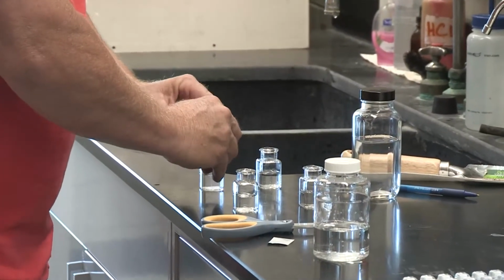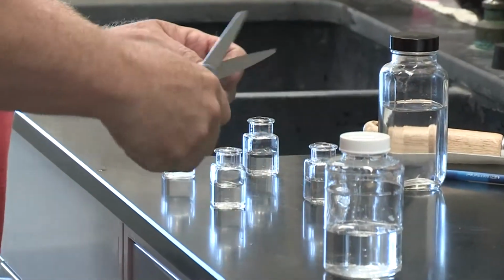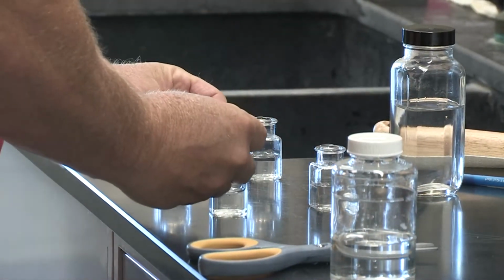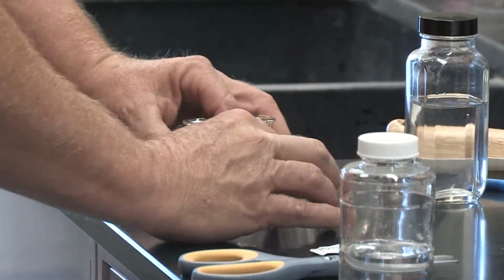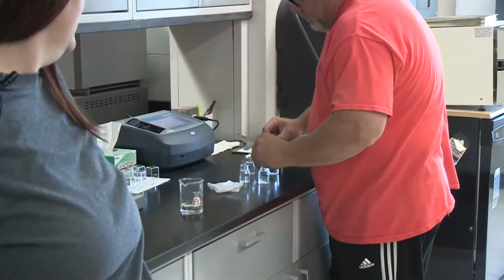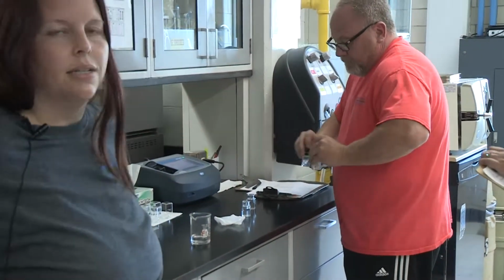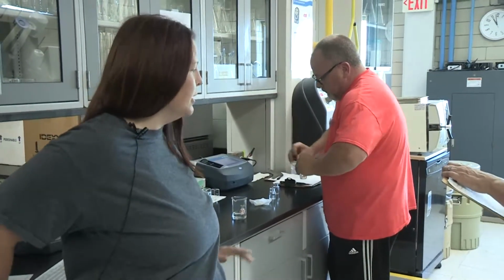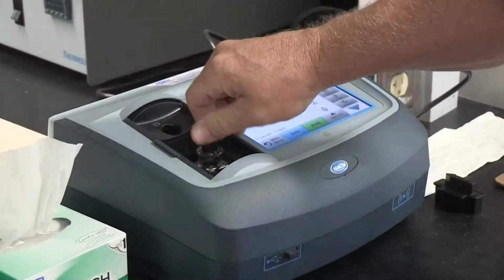If those samples stay clear, that means there isn't chlorine. If they were to turn pink, that would mean that we did have chlorine present. So we put a little packet in, it reacts or mixes with the chlorine, and then we look for a color. As you can see, they're staying pretty clear. So that's a good sign that we have taken the chlorine back out. So those will sit, and then he'll run them in our meter over here, and that'll tell us how much chlorine is left in the water. And we have certain limits that we have to be under, so we can't return certain things or else the state can come in and get us in trouble.